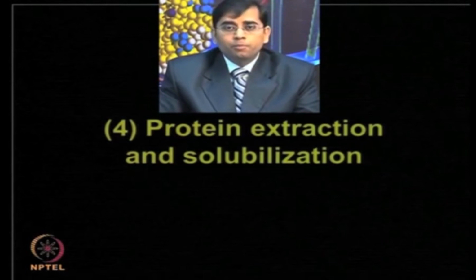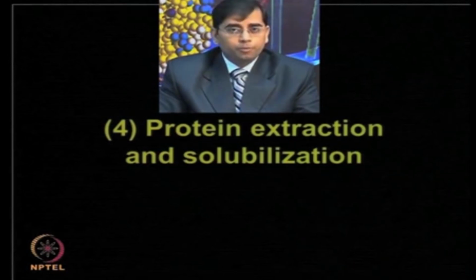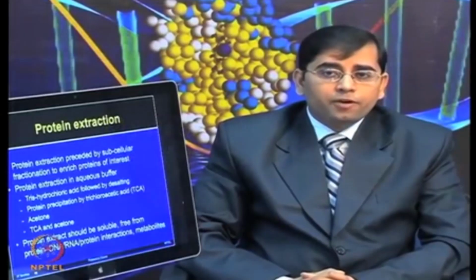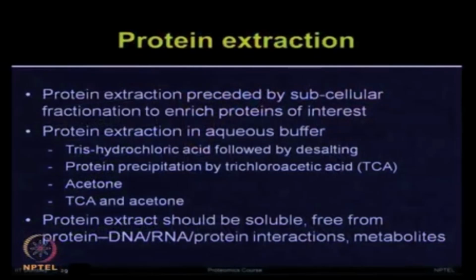Now, this step will be more towards gel based proteomics, where solubilization will be more important. So, protein extraction, after performing the subcellular fractionation, so that the proteins can be enriched, which you are going to be analyzing in your experiment.